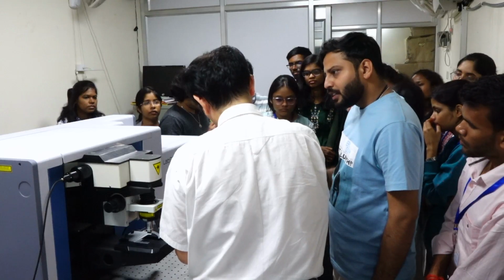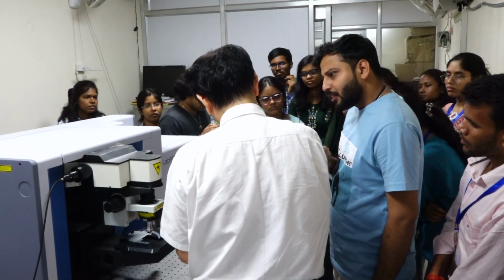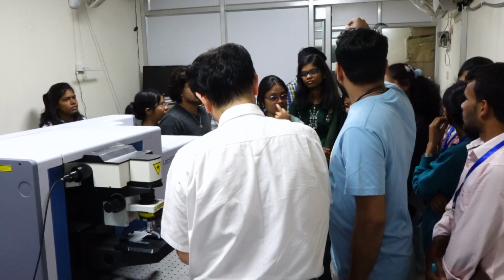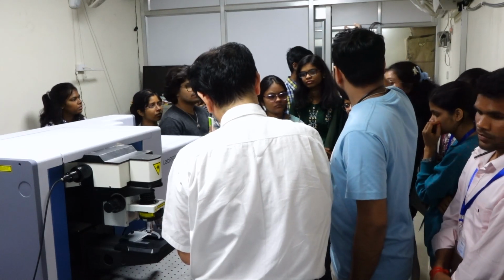So you can use a syringe. It will be, no, it is just a syringe.